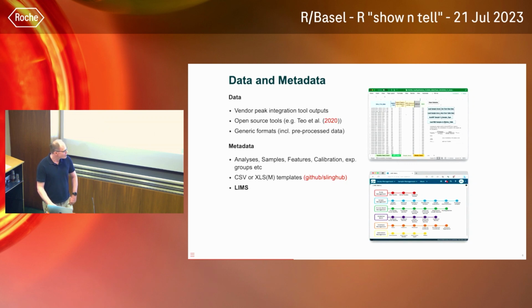So we made some efforts. A colleague of mine has created macro-based Excel templates, with all the disadvantages of macro-based Excel sheets. It helps the users, because it's Excel and they are more familiar with it, to provide the data, to import, for example, the instrument data and to extract samples that have to be annotated. These can then be processed further by scripts. Now we have also started to use a lab information system, which is the only way to go if we deal with large sample scales. So we have an enterprise-grade, SQL-based lab information system, where the package I present can access the data directly, some of the metadata, and hopefully more and more.